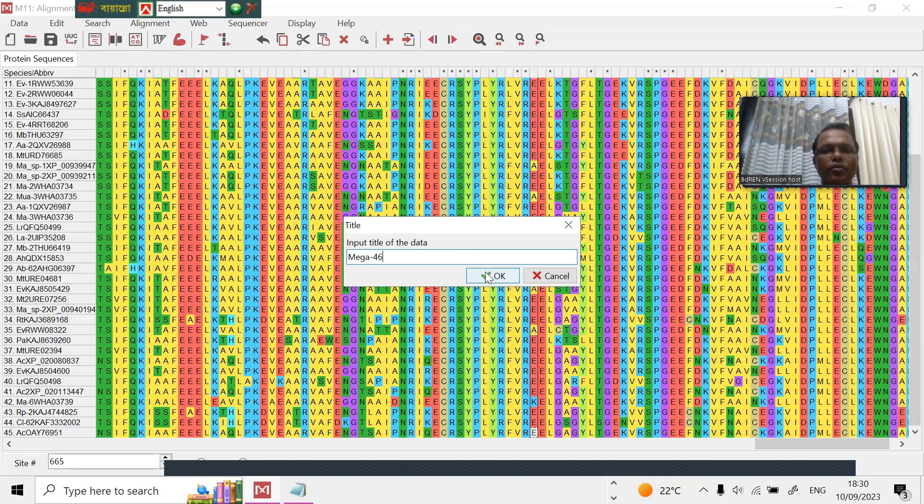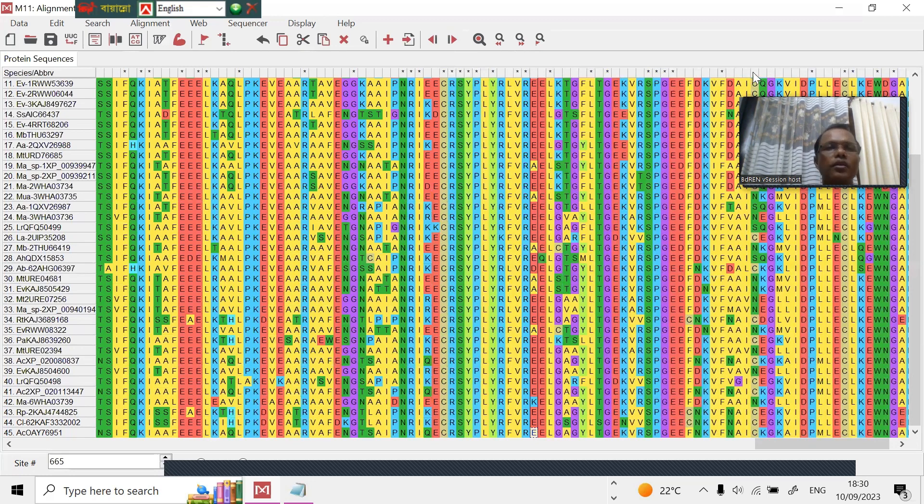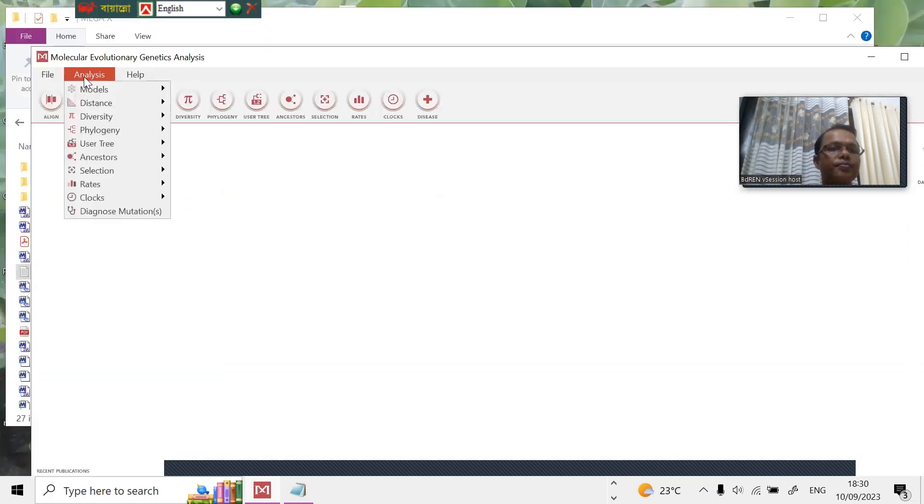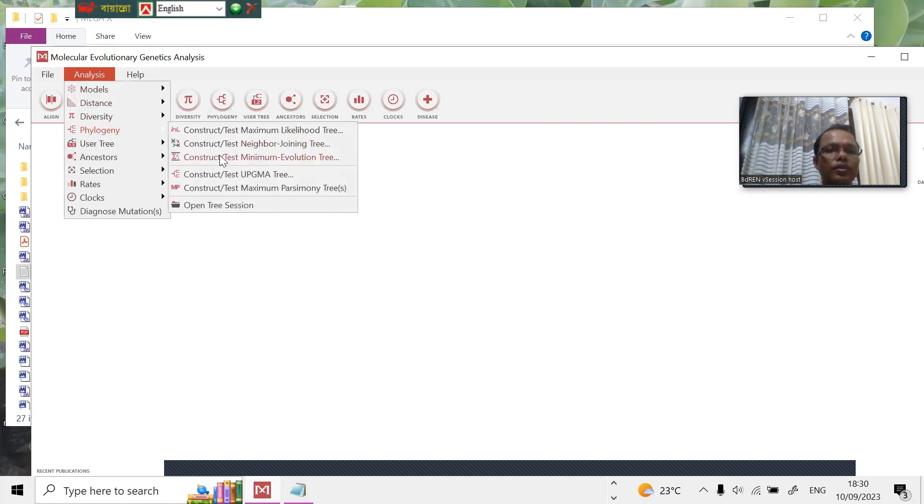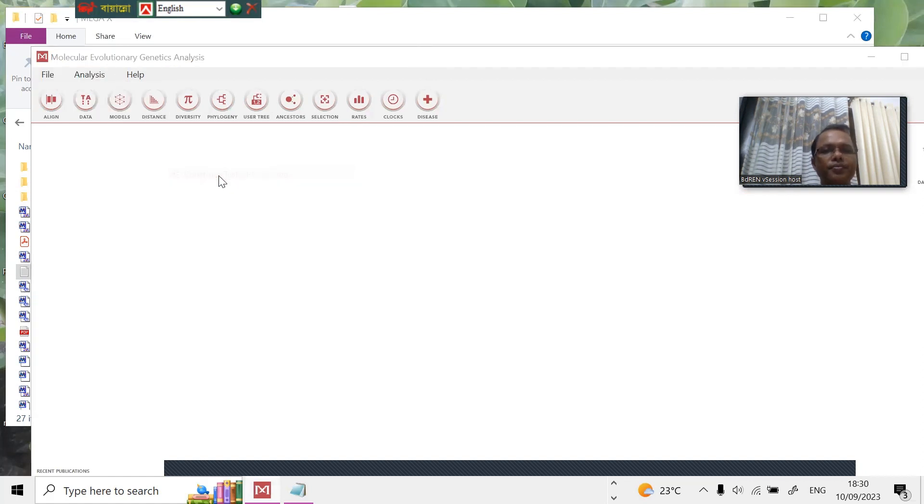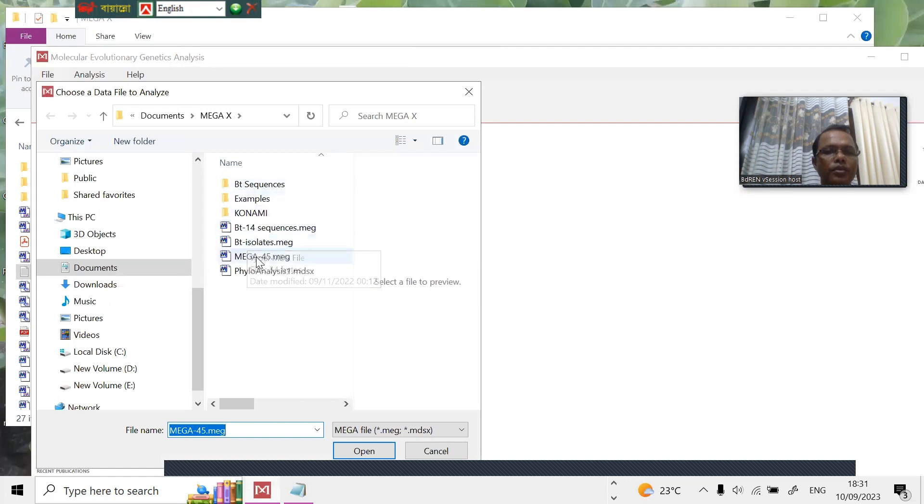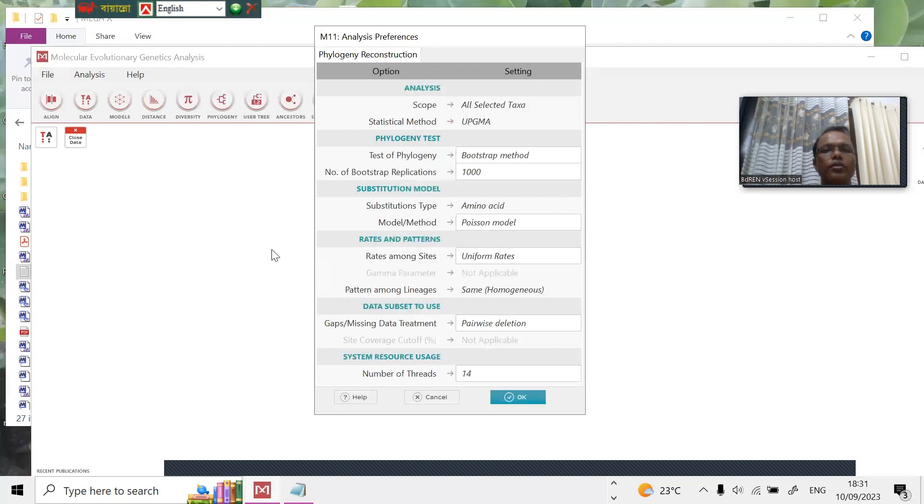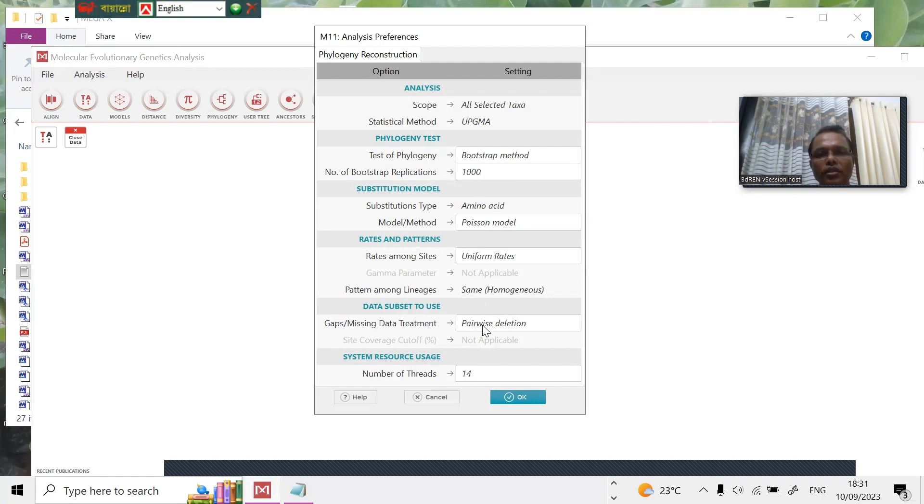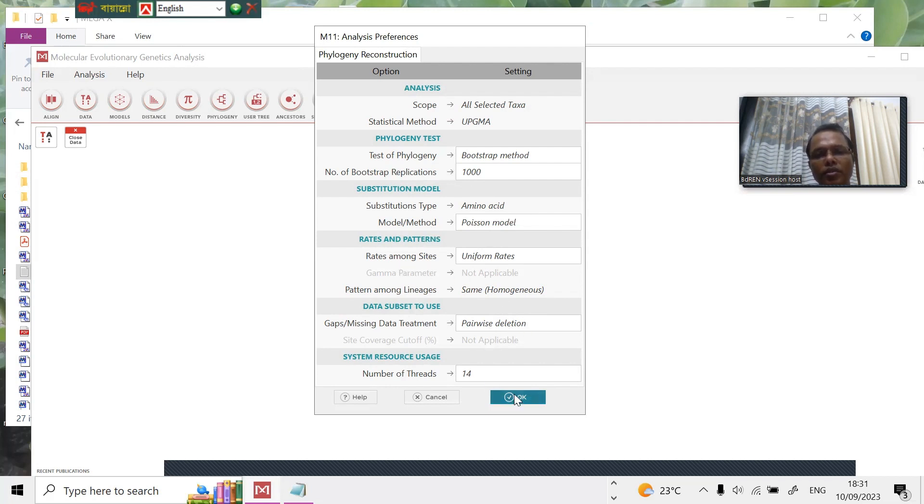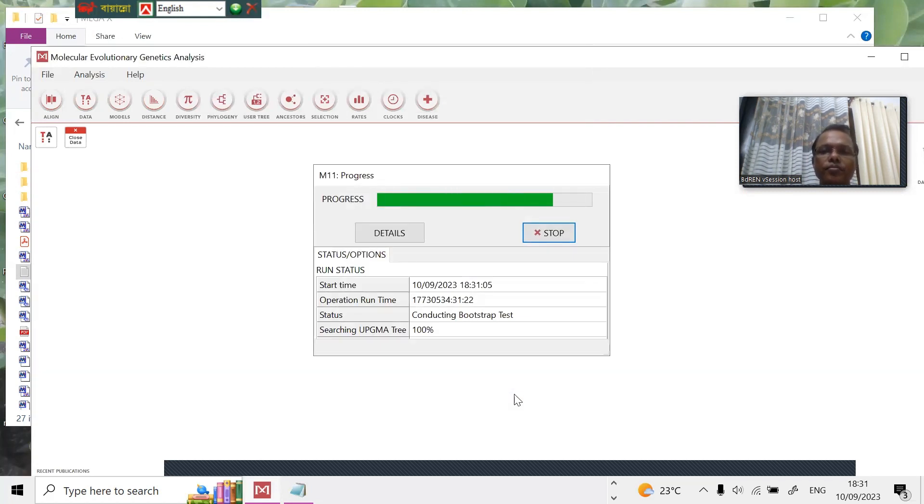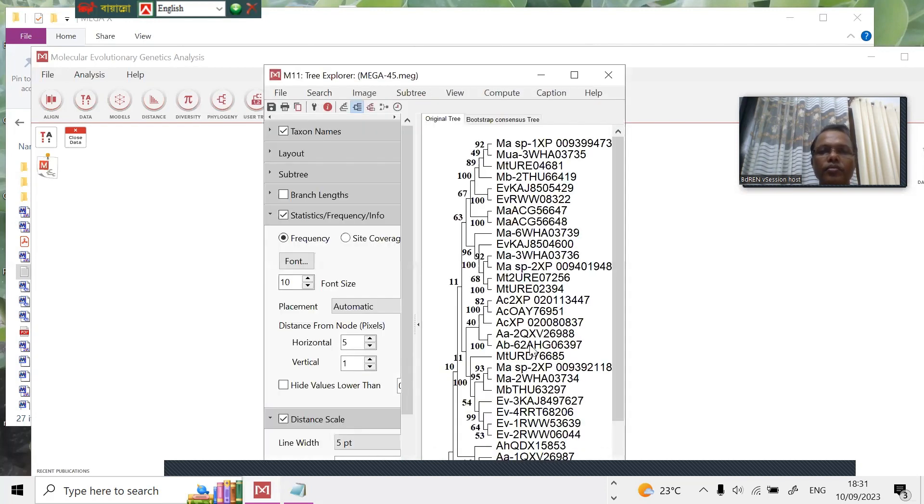Now just close. Now analyze the phylogenetics. Construct/Test UPGMA. You can see the next one, MEGA. For the phylogenetic analysis, the number of bootstrap replications is 1000, and all other parameters, the Poisson model, all of the default system. We can just press OK. It's coming.